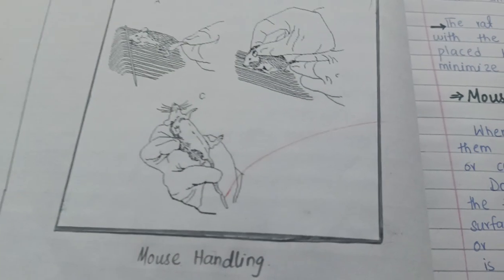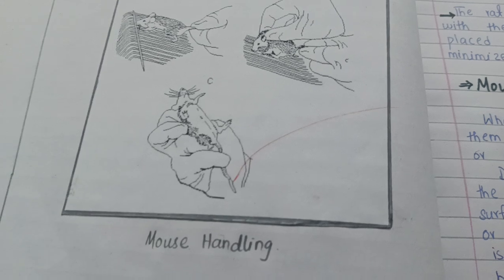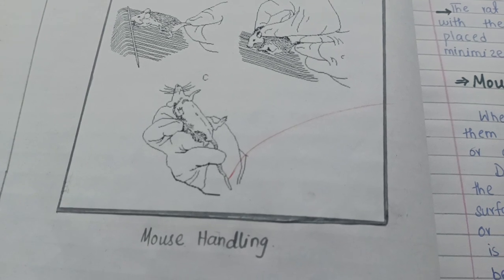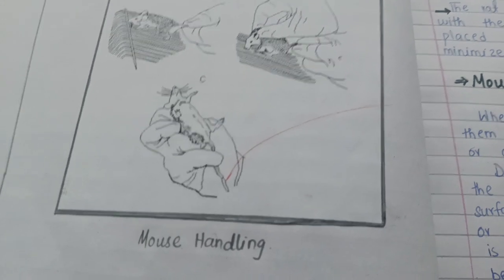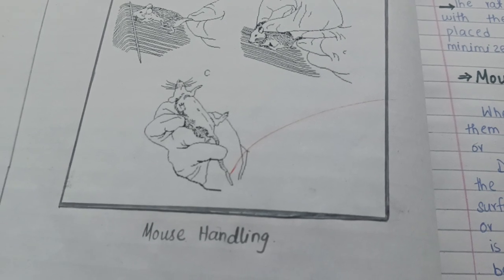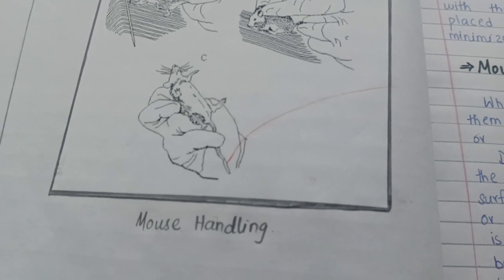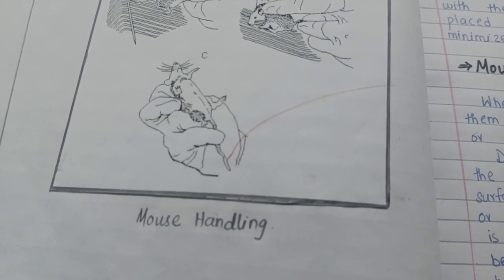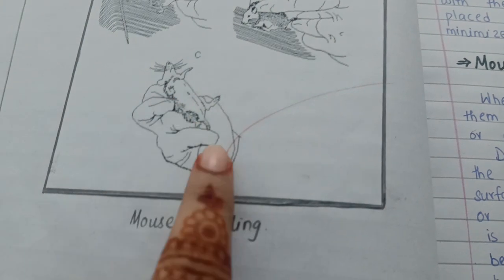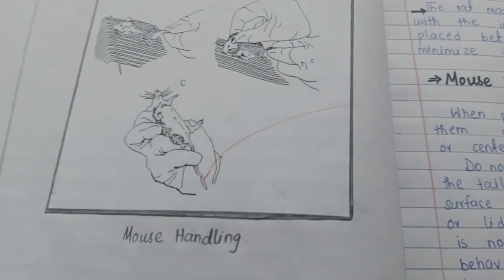If you have seen the cage of a mouse, the upper part is made of a wire net. So you have to place the rat or the mouse over the wire net of the cage. It makes a comfortable position, and then you can rest the body against your waist. It will keep the rat in a comfortable position.